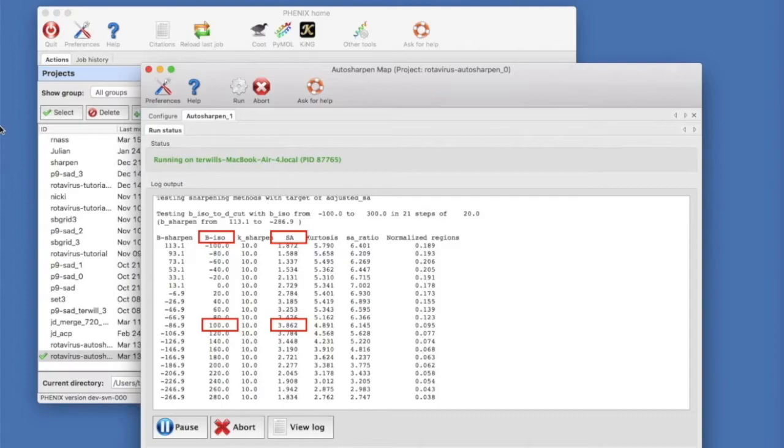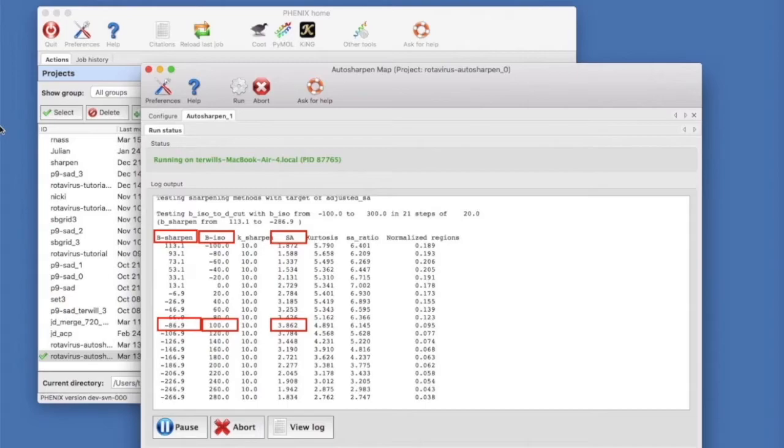The best value of B iso is 100 with an adjusted surface area value of 3.9. This corresponds to a sharpening B applied of minus 86. That is, the map is blurred compared to the starting map.